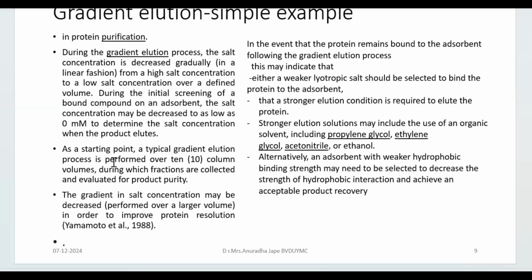All right. Now, probably you get to know what is happening. In yesterday's and previous TLC lectures, we have talked about what are the kinds of interaction between the support matrix, stationary phase and analyte, and mobile phase and analyte. So partitioning between the two and adsorption onto stationary phase are going to be the factors which decide the elution.